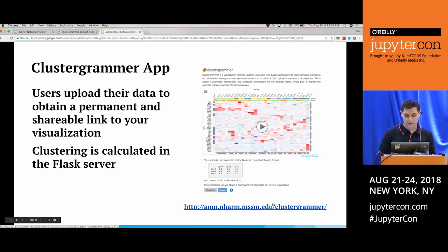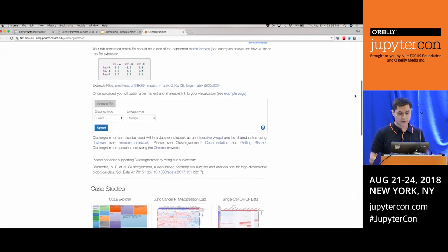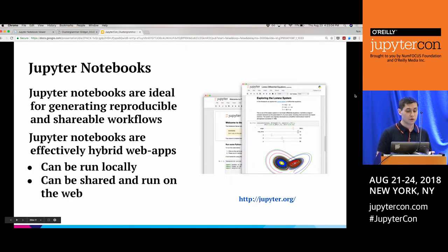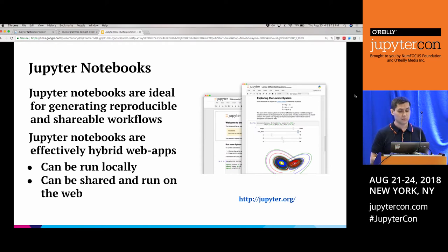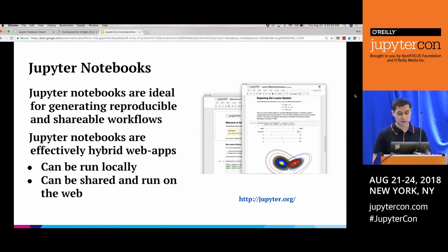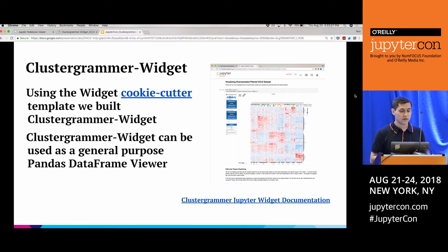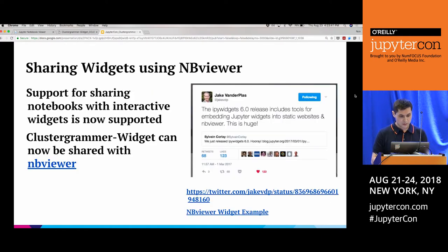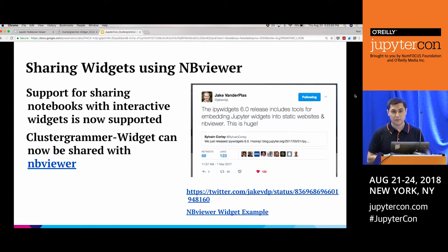We also built a small web app for ClusterGrammar where you can upload data and get a permanent, shareable visualization. One of our goals was to get ClusterGrammar running in a Jupyter Notebook. Jupyter Notebooks are ideal for reproducible and shareable workflows — they're hybrid web apps runnable locally, shareable on the web, or deployable through services like Binder. Using the Jupyter widget cookiecutter template, we built ClusterGrammar Widget. Importantly, support was added for sharing notebooks with interactive widgets embedded in static HTML files, so collaborators can interact with data without running the notebook.